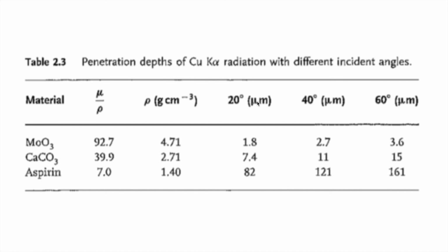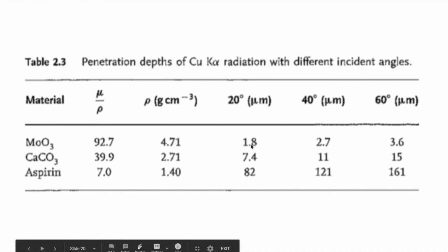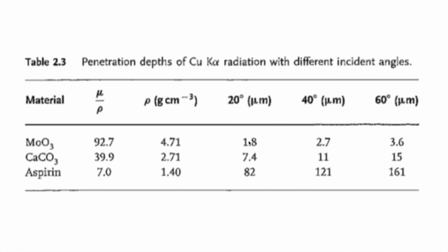So we have a range of anywhere from 1 micron up to hundreds of microns for the depth. That's typically a fair distance, but if there are some surface structures that are different than the interior on the micron scale, then this could be an issue for your X-ray diffraction experiment. So that's something to consider in terms of the penetration depth.